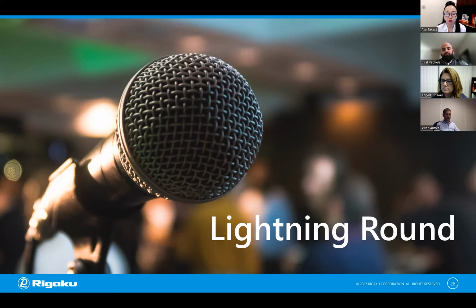And another point that I like is NOVITOM being a small company, I can directly see the use of my work. So I develop the CT reconstruction at NOVITOM and some image processing tools, and I see my colleagues processing the data for the customers with these tools. So this is something that really motivates me also.